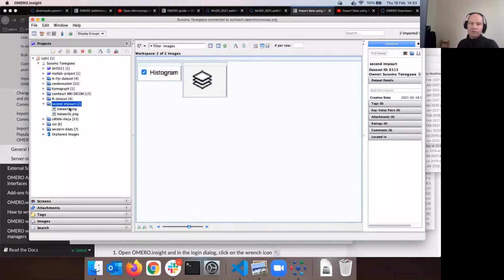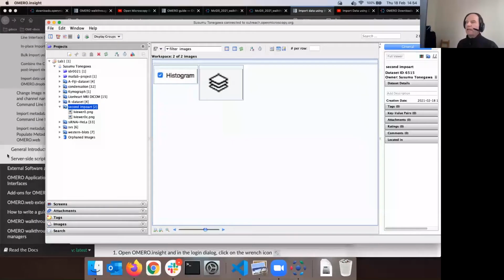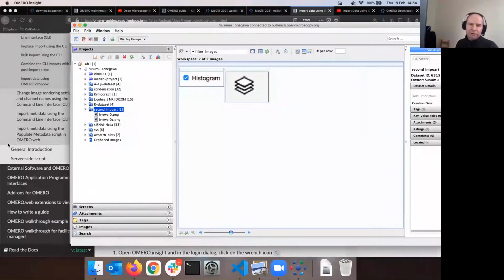These are just screenshots. Yeah, but that's why it's so fast. If you, of course, ventured to import something more demanding, you might still be in the first progress bar, but we warned you about that. That's fine. Remember, please, that you are importing from Canada to Europe. Okay, so your images are going through the wire from Canada to Europe. So think about that. Okay, it might under circumstances be quite slow.